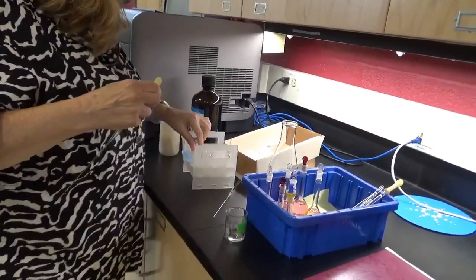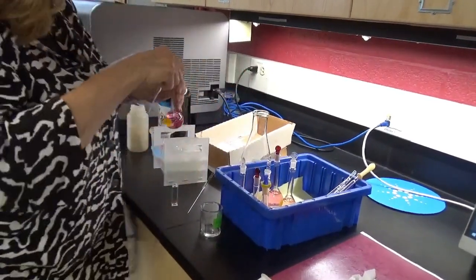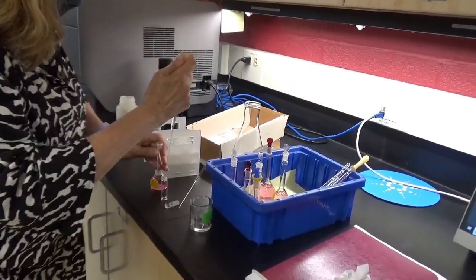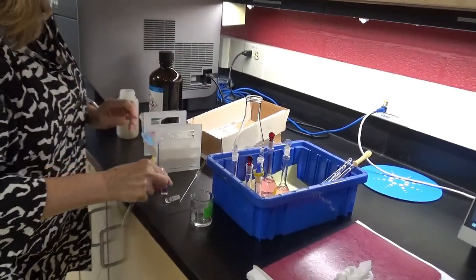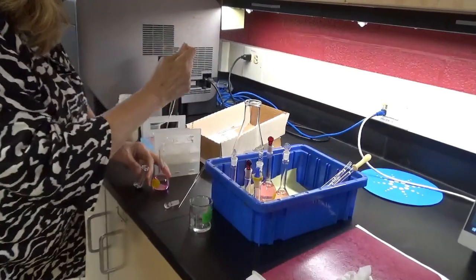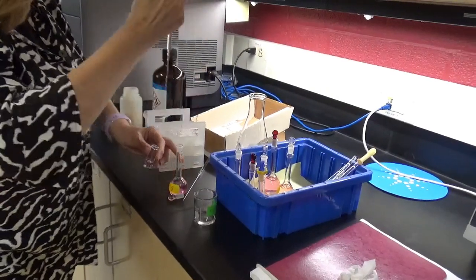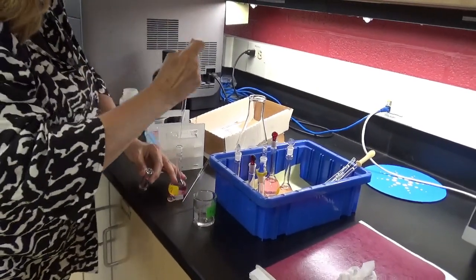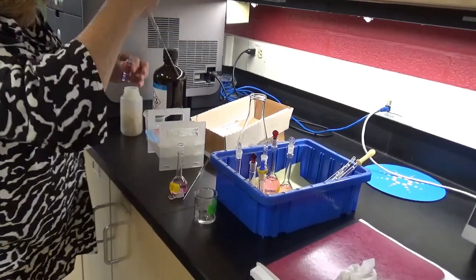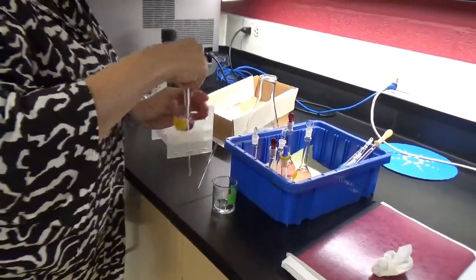Number 2. Rinse it once. I'll have to wipe these with Kim wipes also before I put them in the instrument.